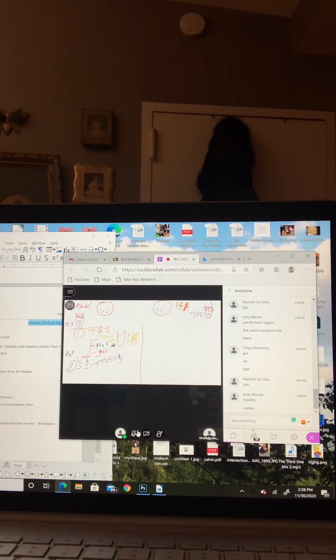Good. So the SIM is a semi-solid medium, if you remember. You have to stab your medium using an inoculating needle. So you stab, and after incubation, you get these results. This is the SIM tube, a semi-solid medium to study the motility. So we talk about this.